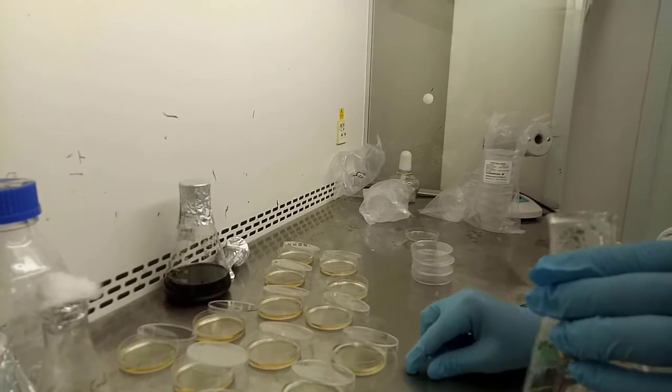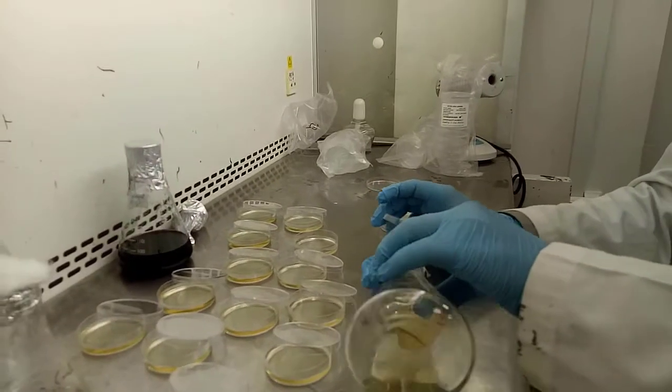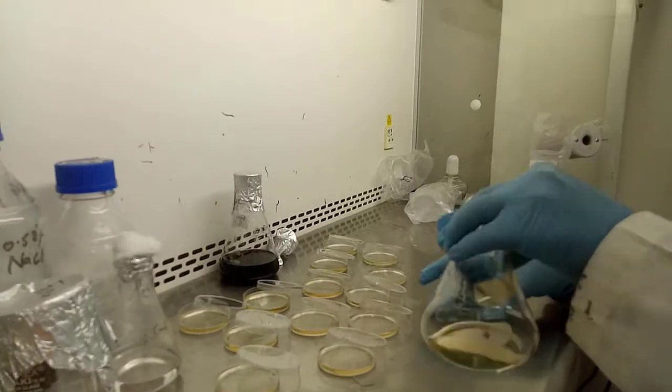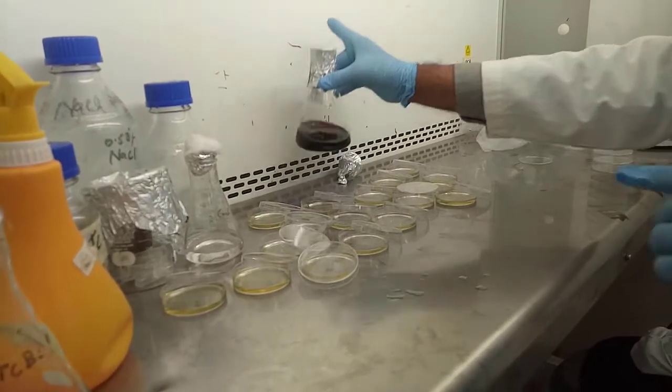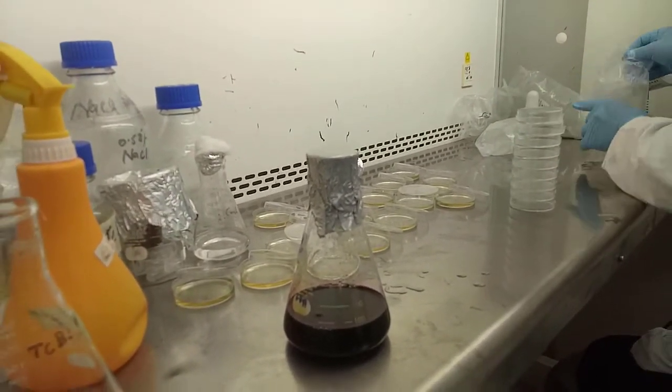TBX agar media composition is 3 grams in 100 ml — I have used this for the total coliform group. We usually use EMB agar media, 3 grams in 100 ml. In this video I have used 60 mm size petri plates due to a small amount of agar media.